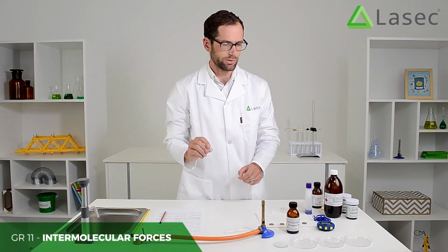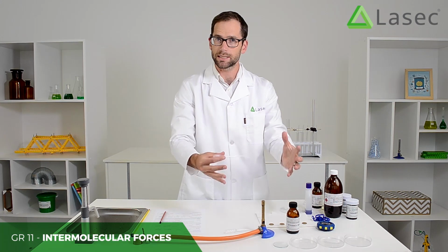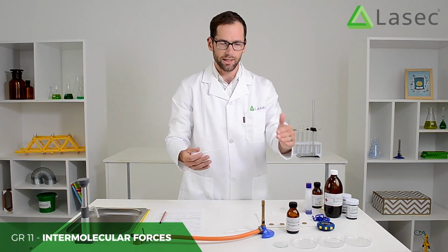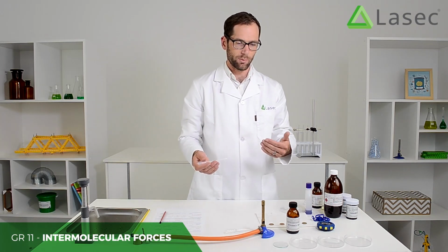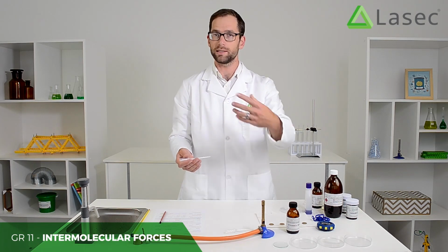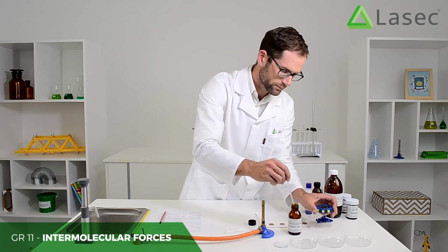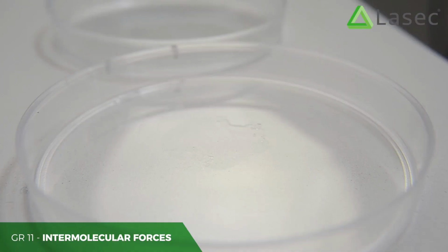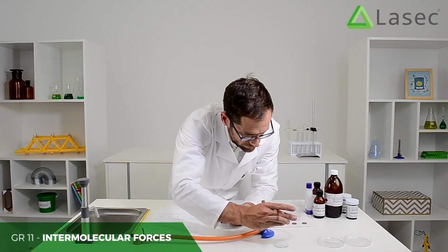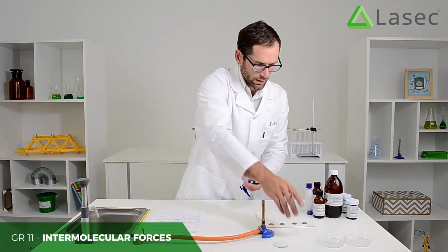and if they'd like, what they can do is have their stopwatch ready and get 4 learners, if they're working in teams, they can each drop as they start the stopwatch, and then as each one evaporates, they can mark down the time so they don't have to repeat it. If they try to do it where they do each one on one watch glass, then the next one, then the next one, that does work, but it's going to take a lot more time. One minute 16.